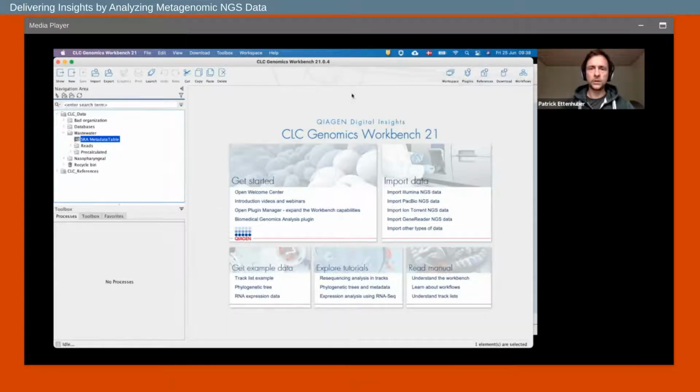In general, this space will be occupied by the visualizations of your data whenever you open a data element. In the top row, in the upper left, you find different buttons which you can use to import and export data, launch tools, cut, copy, paste, delete, standard controls.